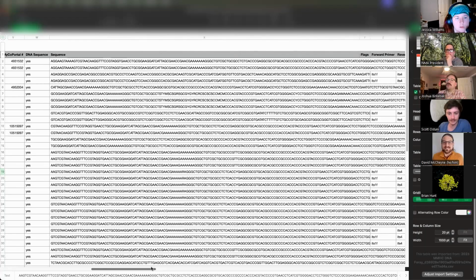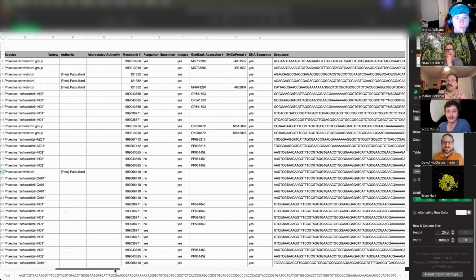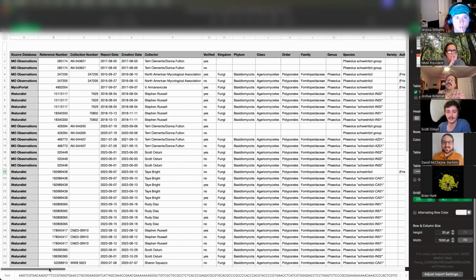Like I said, I'm kind of brute forcing data out of MycoMap, and I don't know that Steve clearly had this intention in mind for the export function, or I don't know what he does with it, or if it was an idea that got abandoned at some point, and now it's half functional, but it does get data out.